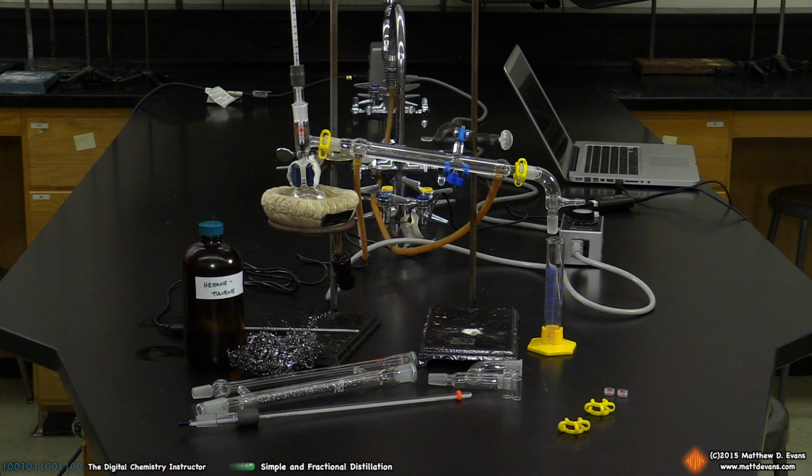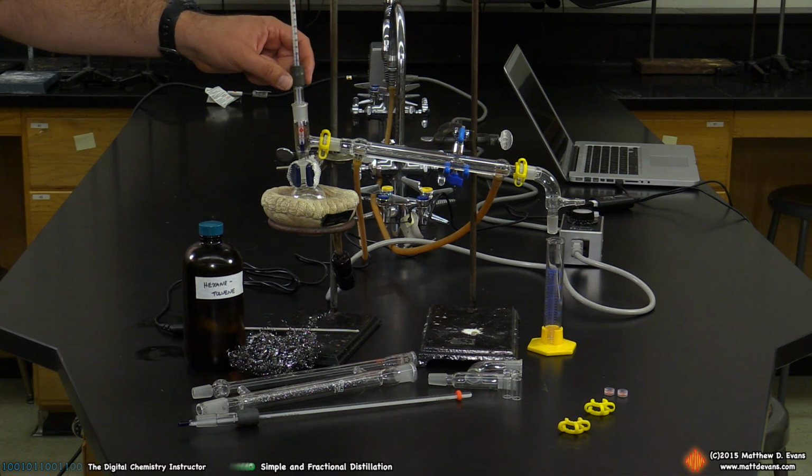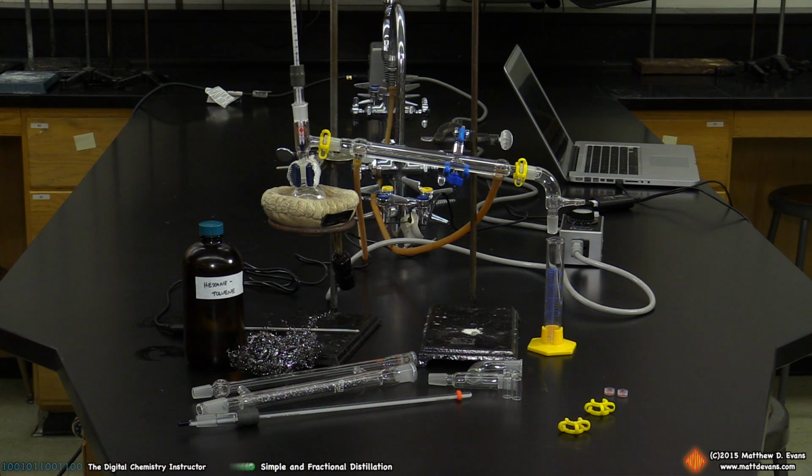But otherwise, you can do that if you want to. Okay, so at this point, to complete this distillation, I'm going to take you through the actual data collection. I'm going to switch from an analog thermometer to a digital one, so you can actually see the temperature profile as we do this distillation.